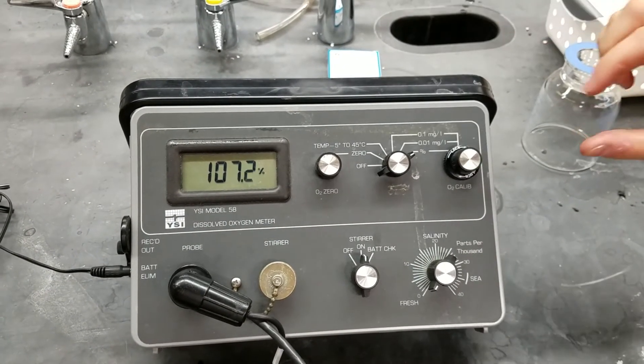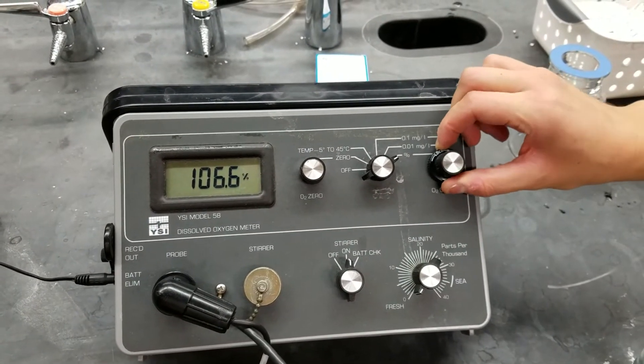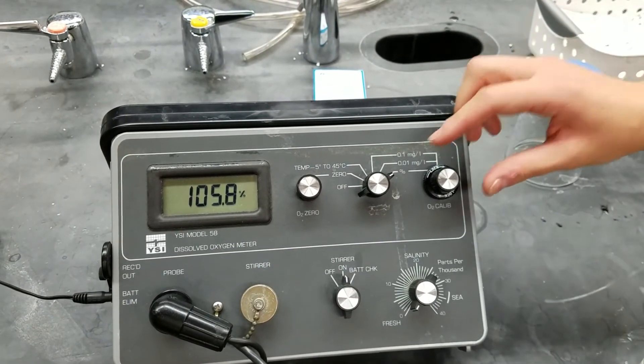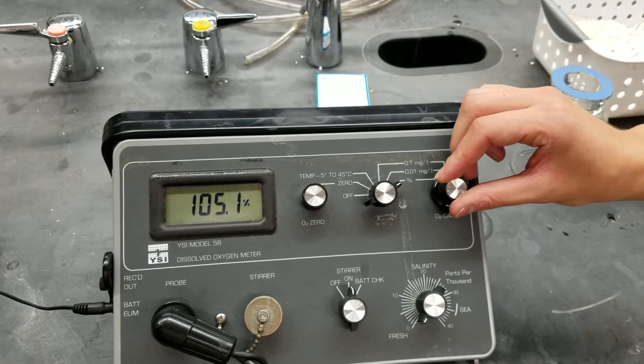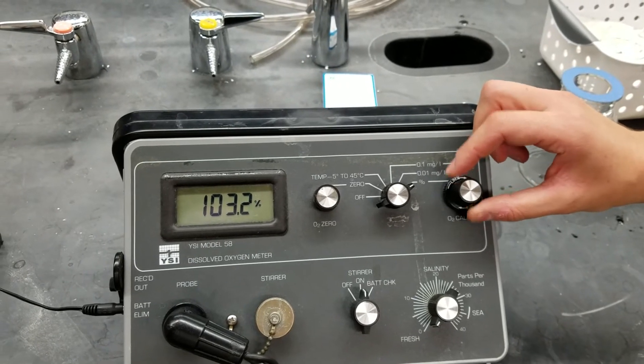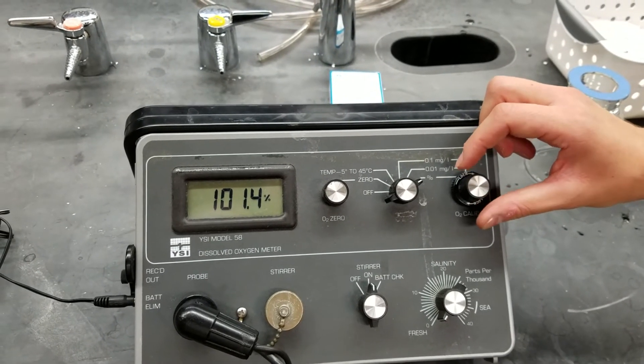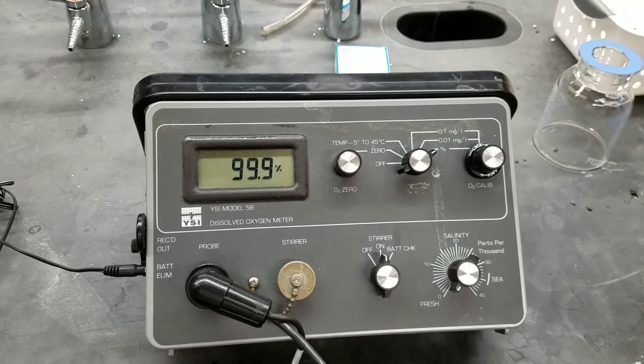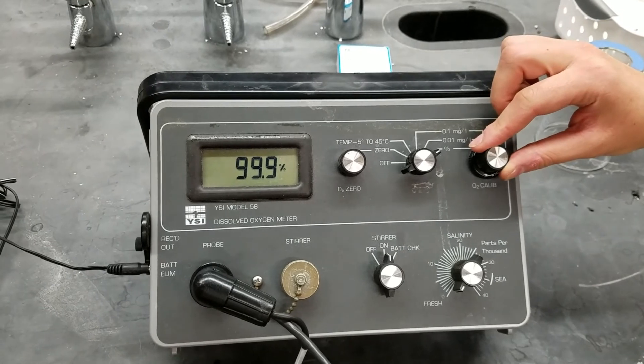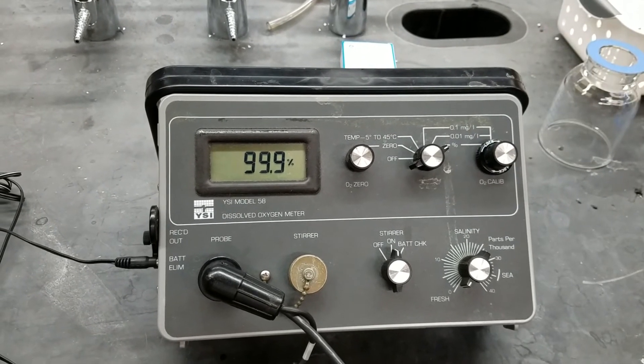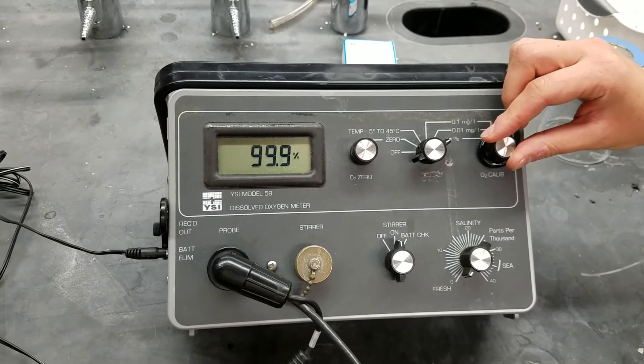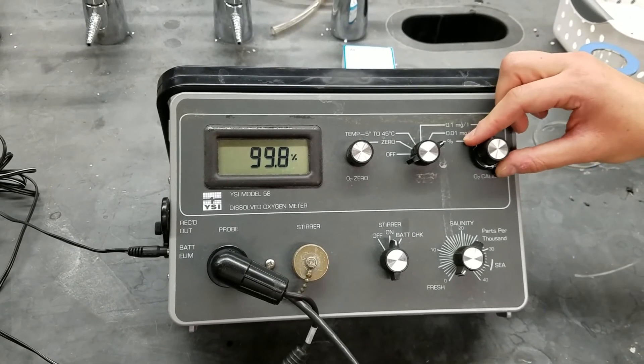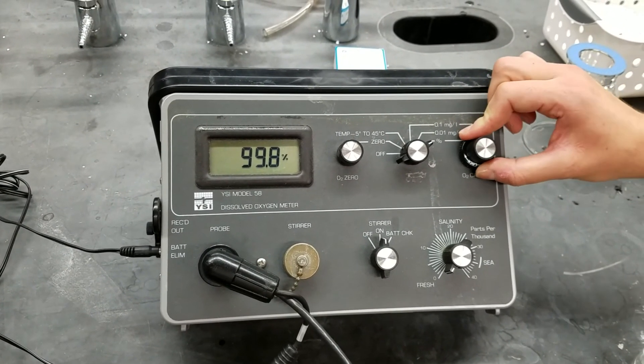And so the way we shift that is we come over to this knob, you have to unlock it first by shifting it that way. And then you turn this top part of the knob until you hit 100%. And then you lock this again.